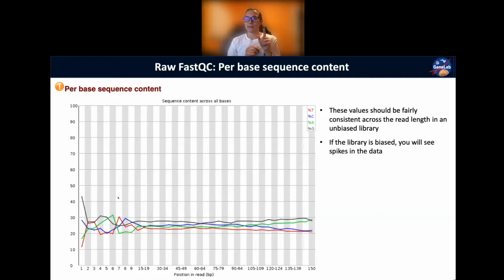Ty, you're right on, but I'm going to follow up with that. Mark, primer dimer contamination could also be the case, and we'll see that there's actually another graph that looks specifically at that. But Ty, what primers are you referring to?